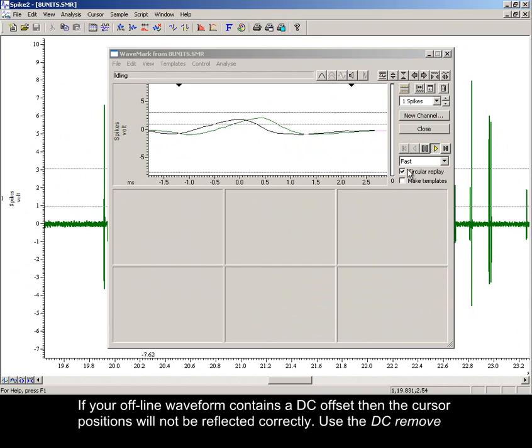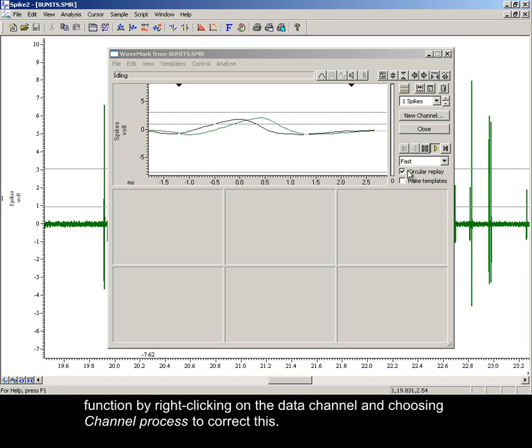If your offline waveform contains a DC offset, then the cursor positions will not be reflected correctly. Use the DC remove function by right-clicking on the data channel and choosing channel process to correct this.